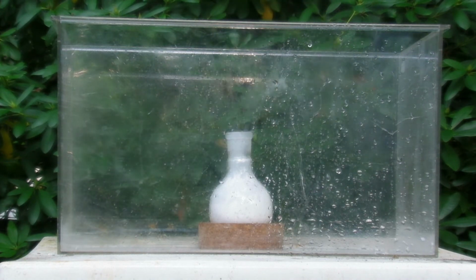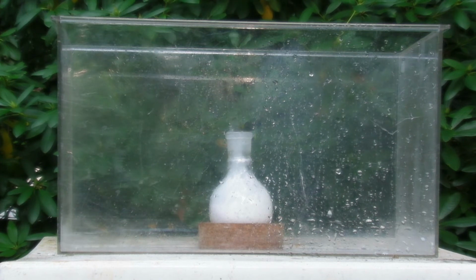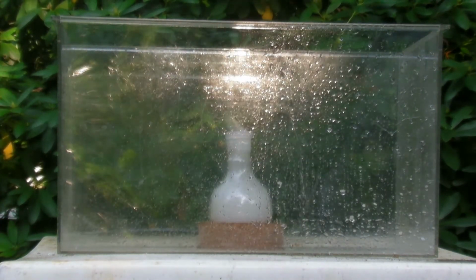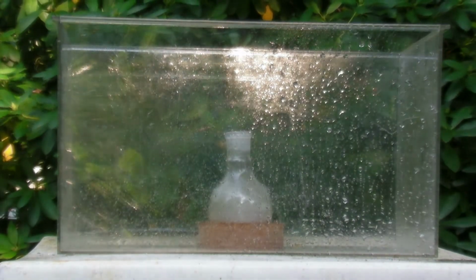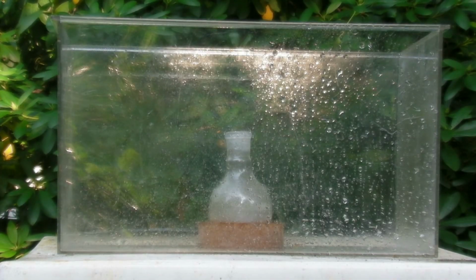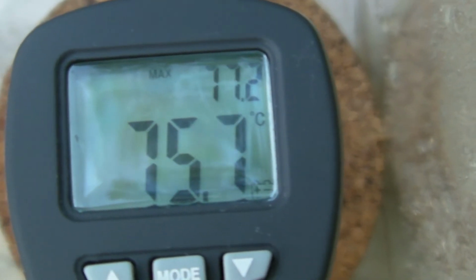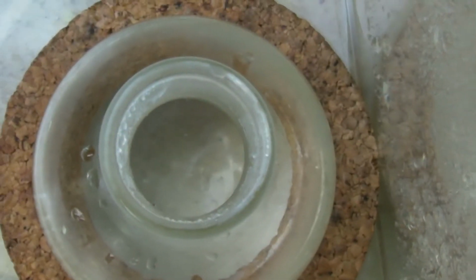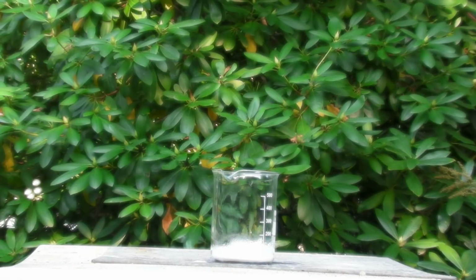A correct solution might probably have been to add sulfuric or phosphoric acid until everything became liquid and then add the liquid mixture to ice-cold water or even directly to ice. Corresponding to the first test, the reaction was not too violent and was over within a few minutes. The temperature of the solution was only 77 degrees C, while I was awaiting it to be way above 100 degrees C. The phosphorus pentoxide was also treated with water.